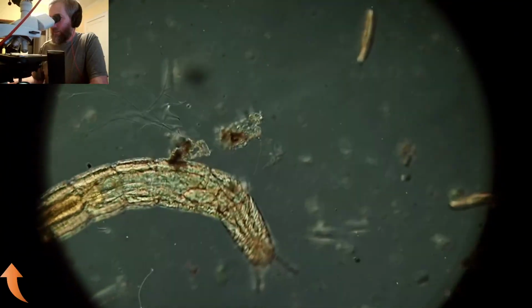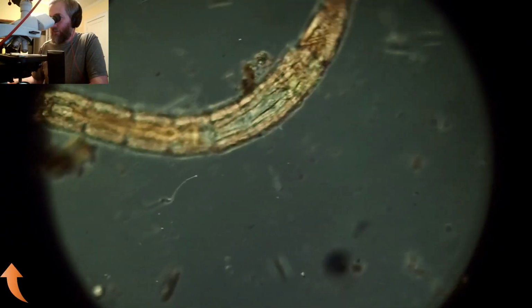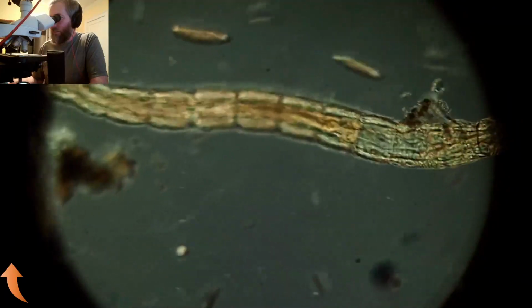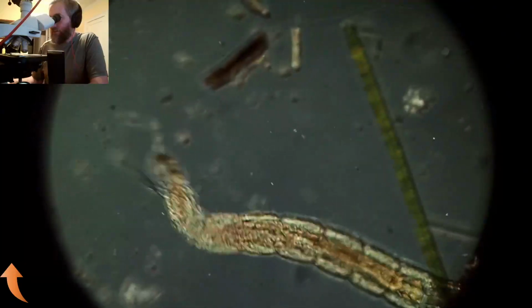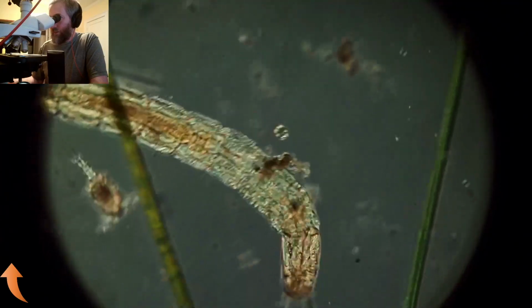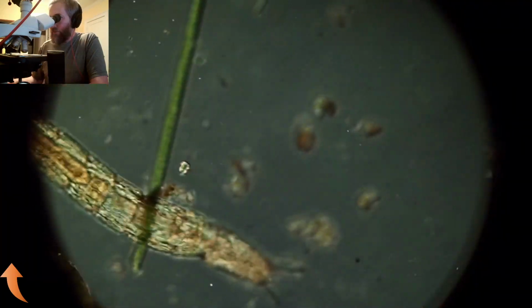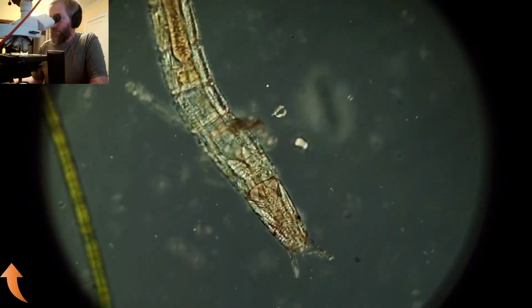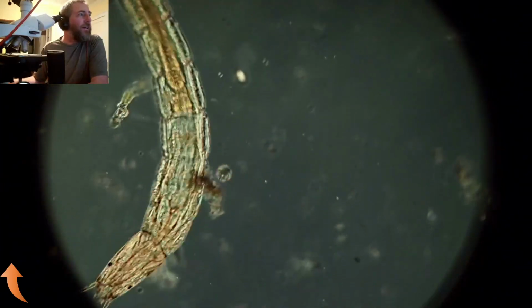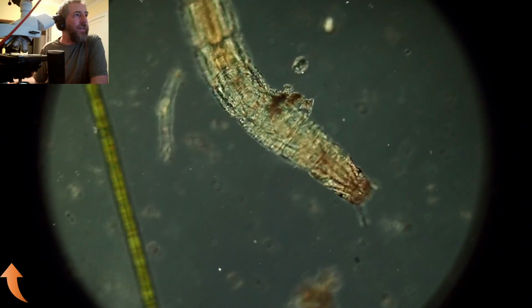Up behind a giant piece of duckweed. Here it is. And like everything else in the sample, these are predators, so they might come across something and eat it. You can see their whole digestive system, like everything else, they're translucent. So I have some colleagues who study chironomids, and they use them for reconstructing things like temperature and lake depth, because the head capsules and some of the body parts will fossilize.